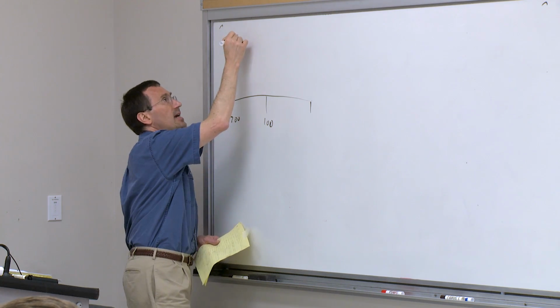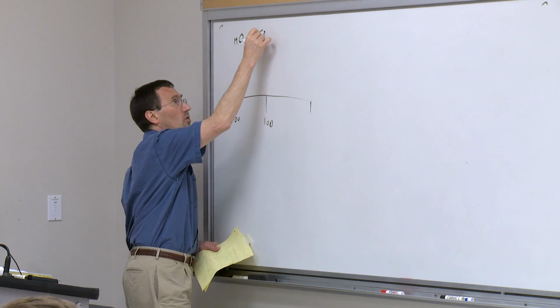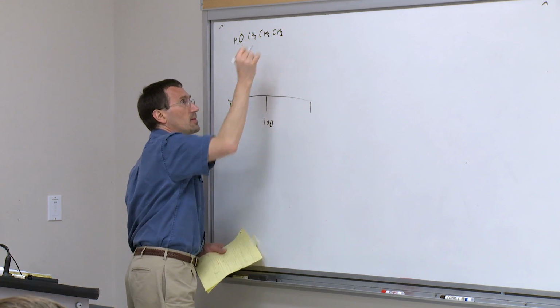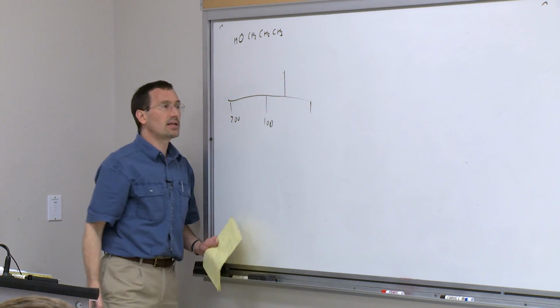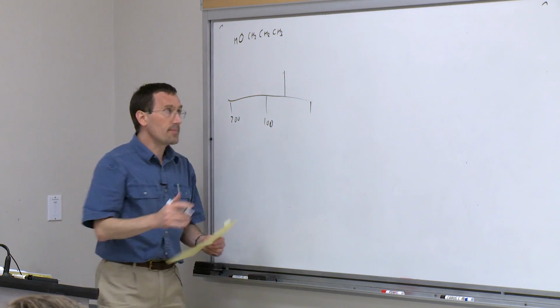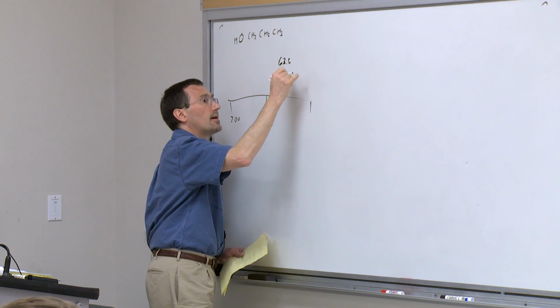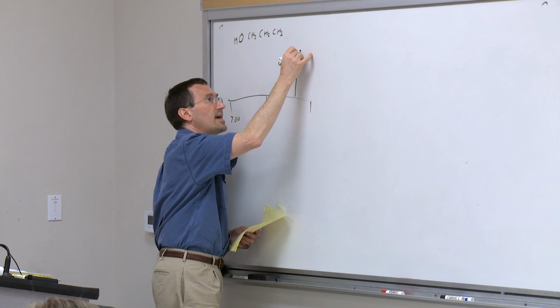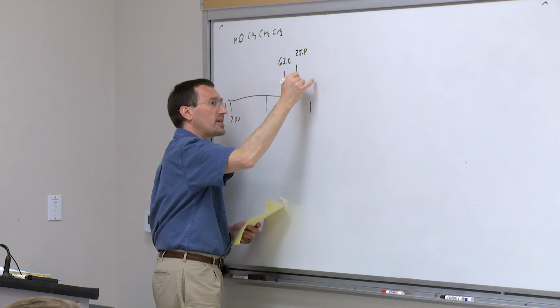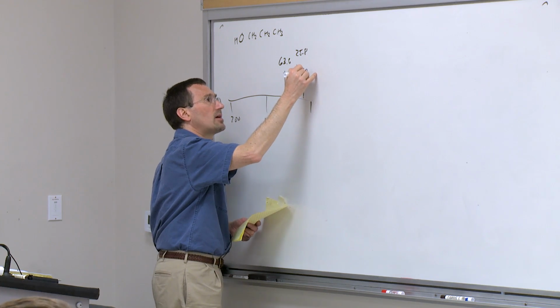So here would be, say, a spectrum of propanol. We'll come back to propanol in just a moment. And so you have a peak, and it would be a singlet, a line at about 63.6. And then you'd have another line at about 25.8. These are actual numbers, of course. Another line at about 10.0.